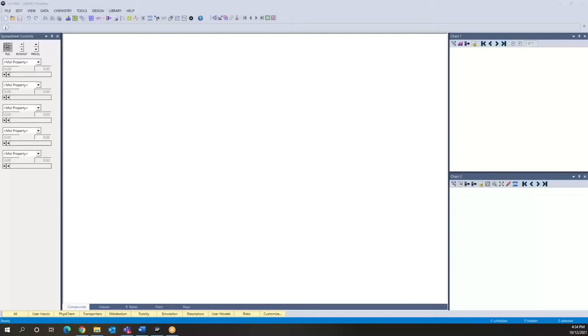We will go through parameter sensitivity analysis, dose estimation, as well as the generation of CP time curves. We will also see how you can use experimental values as part of simulations. There's a lot to cover, so let's get started.